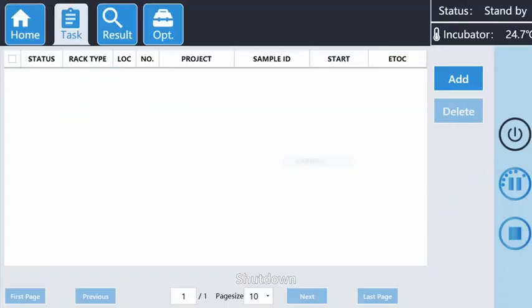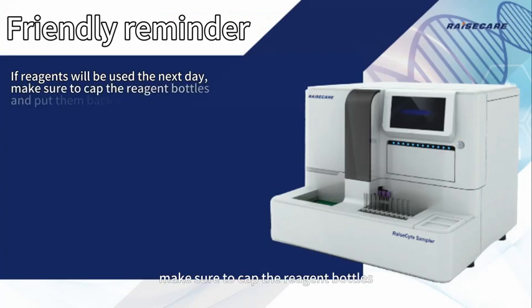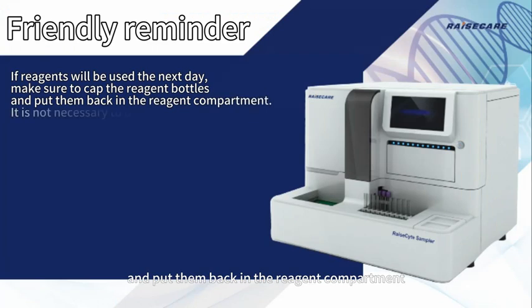9. Shutdown. After the whole experiment is completed, click Stop and then click Shutdown. Friendly reminder: if reagents will be used the next day, make sure to cap the reagent bottles and put them back in the reagent compartment. It is not necessary to power off.